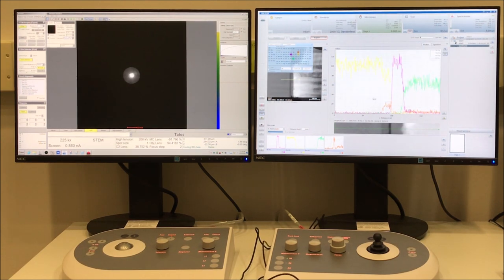So basically, to the left of that dark vertical line is gallium nitride and aluminum gallium nitride. I added in nitrogen there. You see the nitrogen signal's kind of weak, just because nitrogen doesn't like to make x-rays too much. But let's add in oxygen so you can actually see.